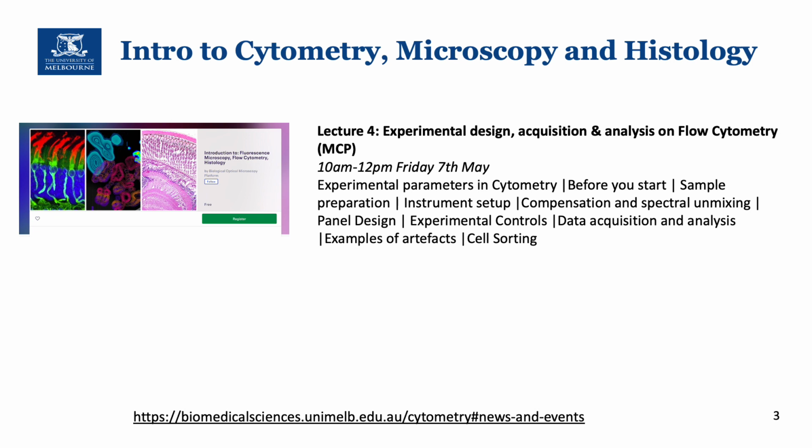I will be describing panel design, which in itself could be a different lecture, but it's an important thing in order to make sure that your panels and your experiments are successful. Going through experimental controls and examples of data acquisition and analysis, including again artifacts in these topics, and I will finish with cell sorting.